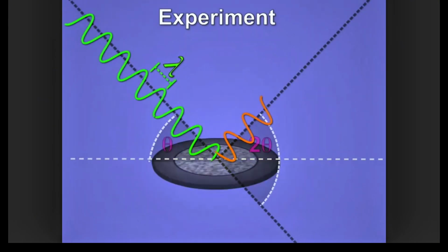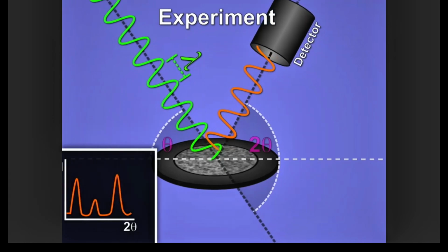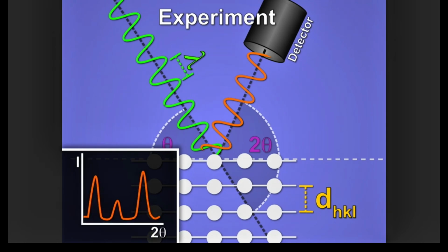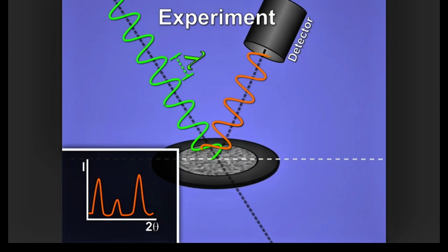In an experiment, the sample is rotated, and the detector that collects the scattered X-rays records peaks in intensity when reaching these characteristic angles. One can then extract the lattice spacing, d_hkl, for each angle satisfying Bragg's law. Using multiple diffracted peak positions, corresponding to several distinct d_hkl values, the parameters of the unit cell can be solved uniquely. 2 main factors contribute to the relative intensity of the peaks.